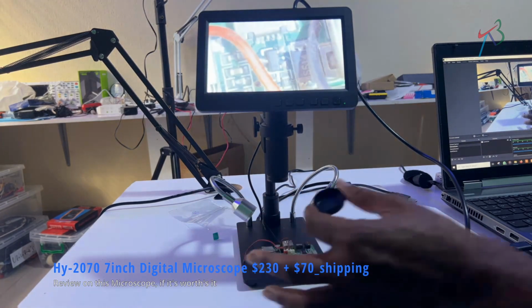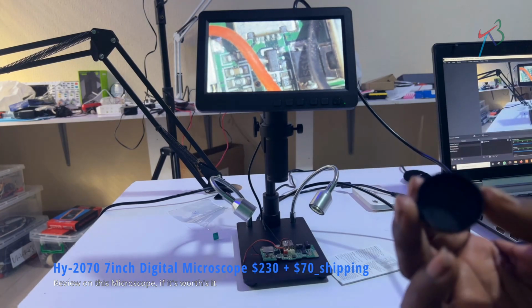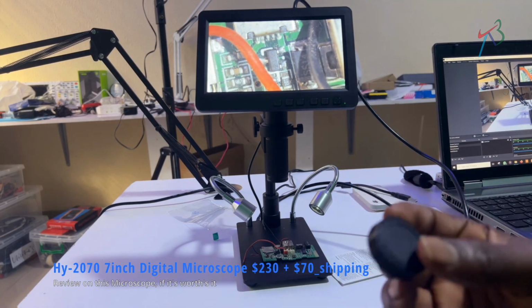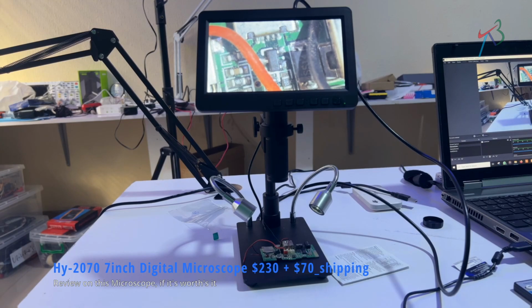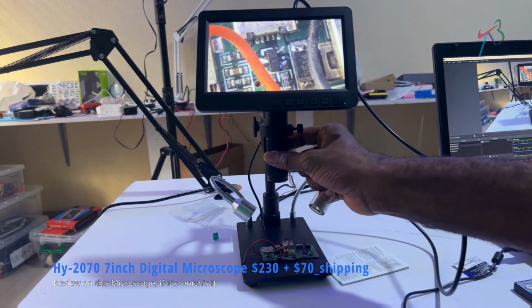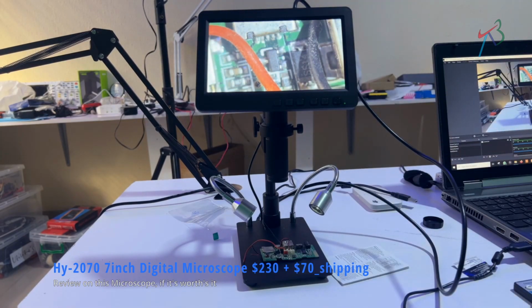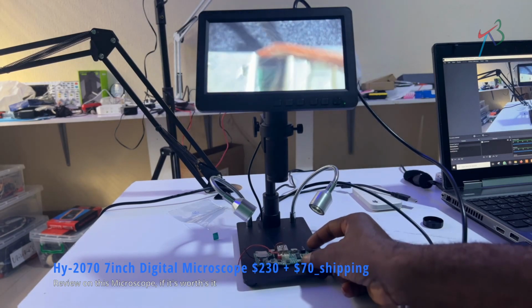So I just remove the cover. You can see this, that is the cover. If you're not using this microscope, I'll advise you to always cover the lens to avoid dust and other unwanted gas getting into the lens. All right, if you're not using it, please always cover the lens.